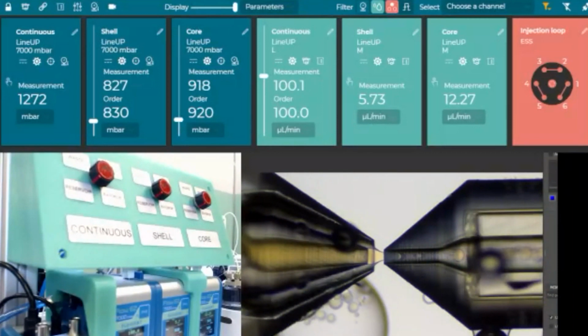Are they always present? Actually, no. It depends on the fluidic regime. But in the regime we use to form this very small droplet for the FACS application, and with the fluids that we use, so this oil, the core phase and the continuous phase, yes, I would say that in this case the satellite droplets are not avoidable, but it is not always the case.